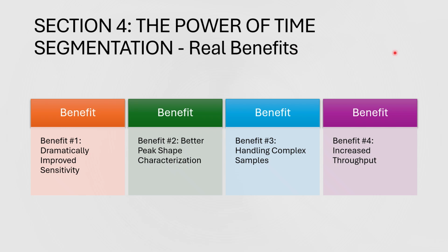Now that we understand the mechanics, let's talk about why this matters for your methods. First is dramatically improved sensitivity. Time segment methods using retention time windows allow for collection of sufficient data points to assure excellent quantitative results, with peak area precision often showing %RSD less than 3.5%.